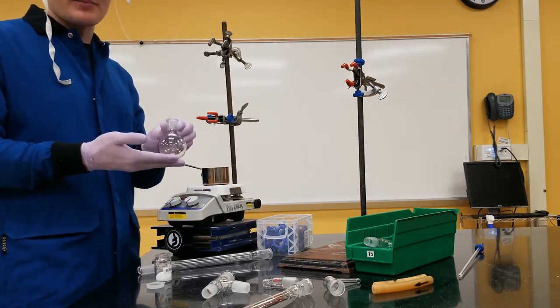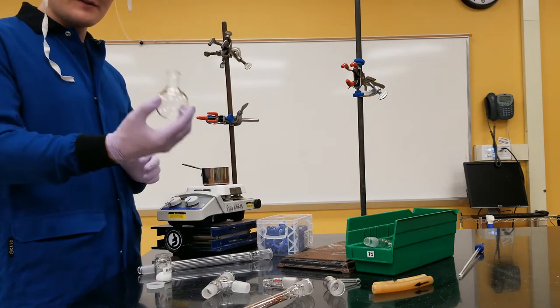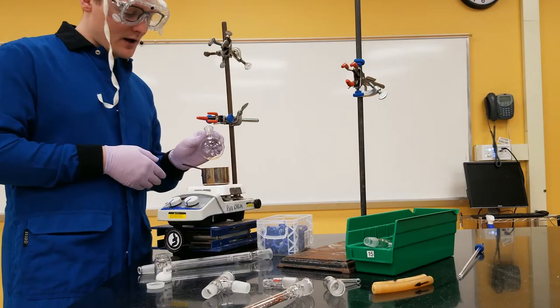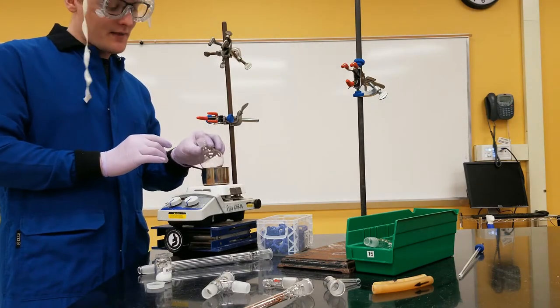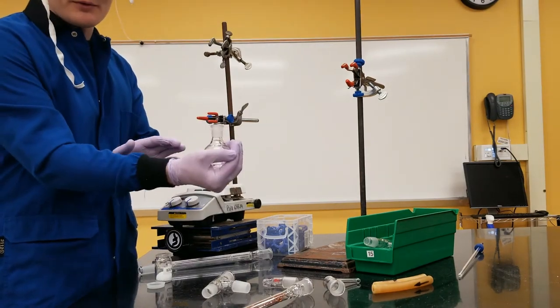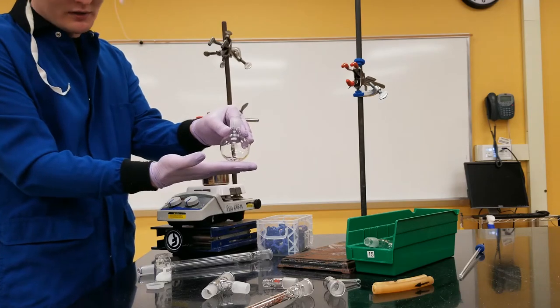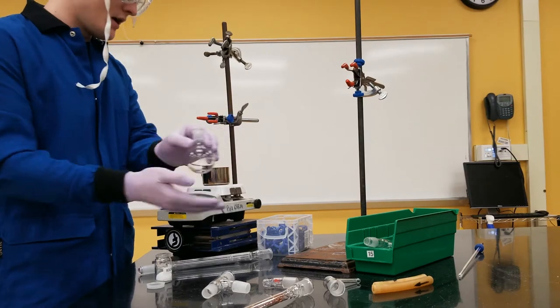the distillation pot, which is a 100 ml round bottom flask today. So this is where your solvents are going to be sitting, and they're going to be heated in an adorable little saucepan, which has a thin layer of sand at the bottom of it. And that sand is going to get really hot, and it's going to cup around the rounded bottom of the round bottom flask and introduce heat faster than if we just set it onto a little contact point. Round on flat does not transfer heat very quickly.